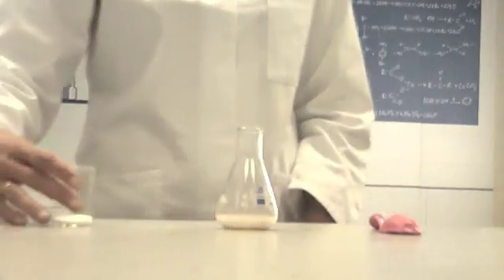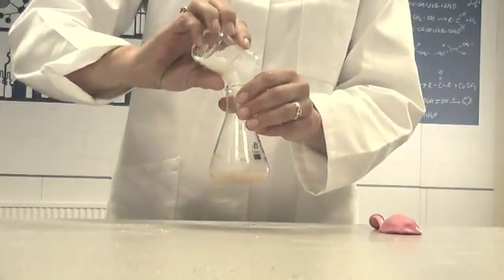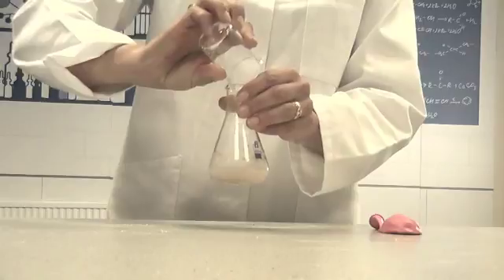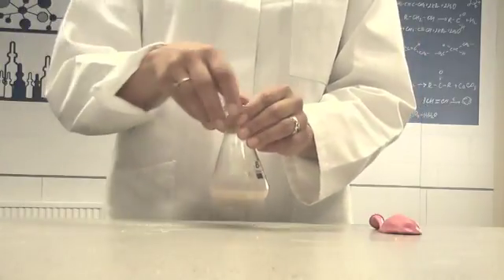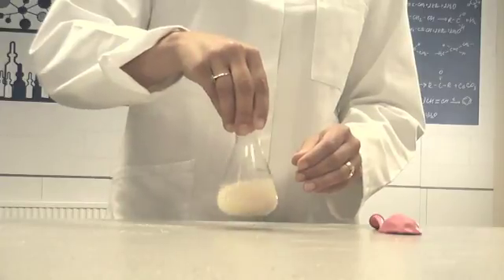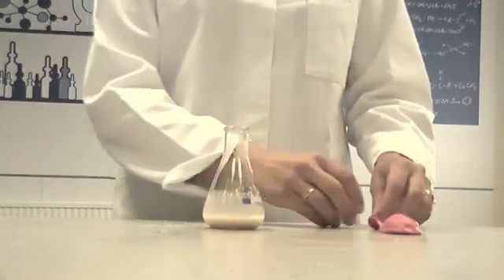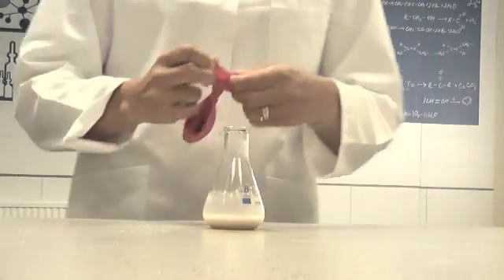Add the sugar and swirl it around some more. Place the neck of the balloon over the neck of the conical flask.